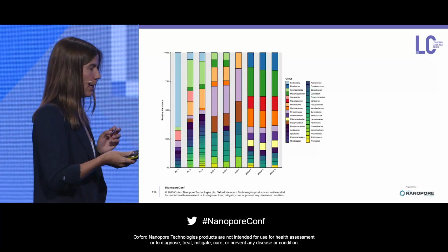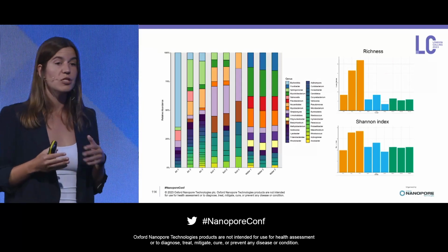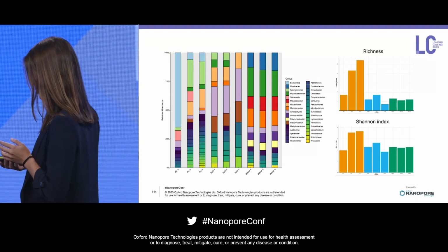And in a very small pilot study that I want to show you right now, we actually took replicates of air samples and water and soil samples at the very same location and processed those samples in the same manner using shotgun nanopore sequencing. I hope what you can appreciate is that we find a very specific water and soil microbiome, and that the air microbiome obviously differs, but also seems relatively characteristic on its own. And interestingly, we find that the microbial diversity in these air samples, both in terms of the actual richness but also evenness, is higher than in the other samples, really motivating us to go further and study this in more detail.